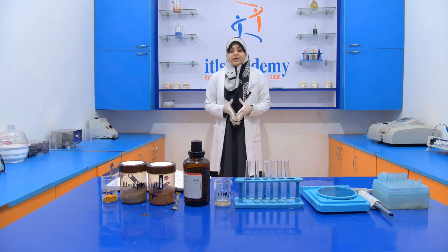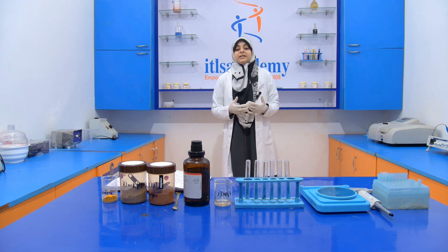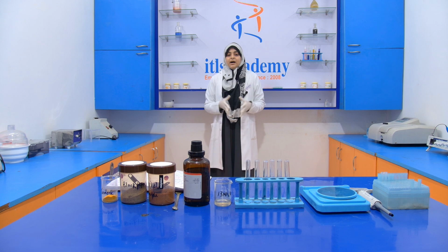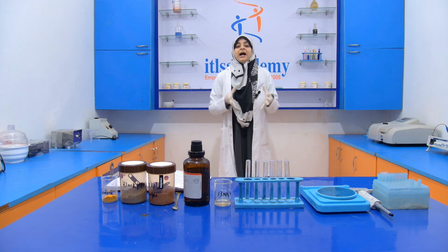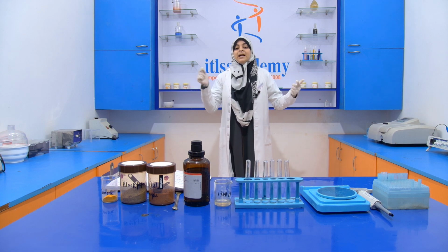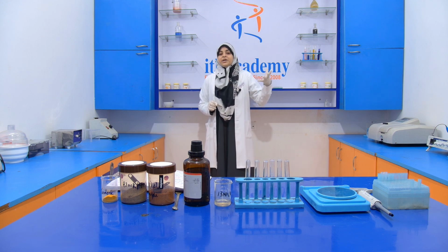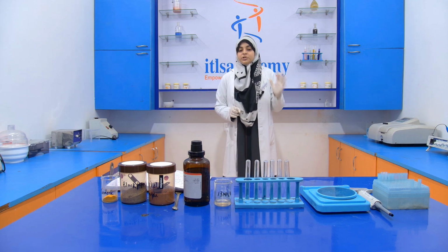Okay, so here the adulterant that we are going to detect is what? It is a color, added color. Now why does this added color come under the category of adulterant? See, every food product has a color, either natural or artificial. If it is natural, then it's okay, we don't take much care for that type of food product because that color is from nature.